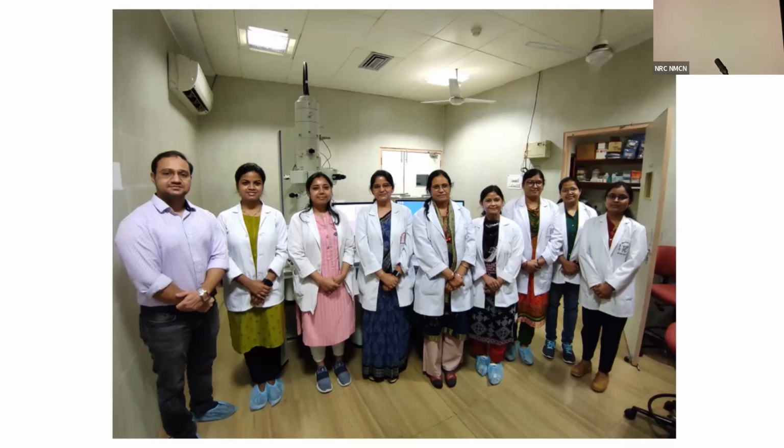Okay. There are some infections in gastroenterology where electron microscopy is very important. It cannot be looked at by an analyzer.